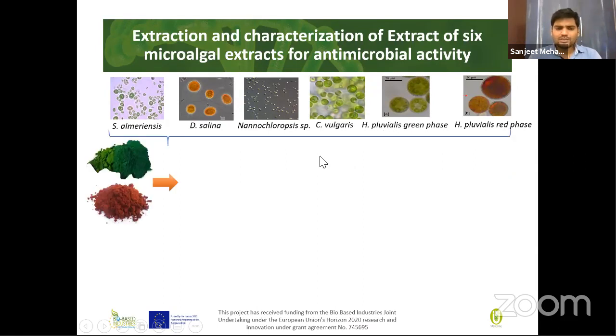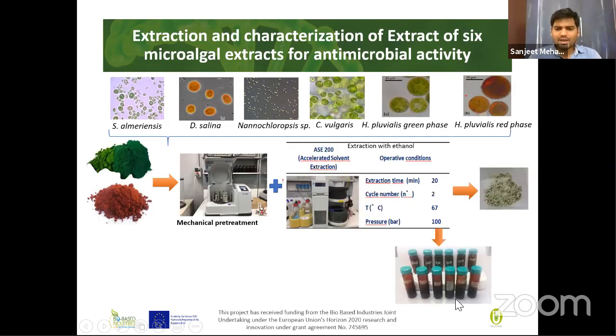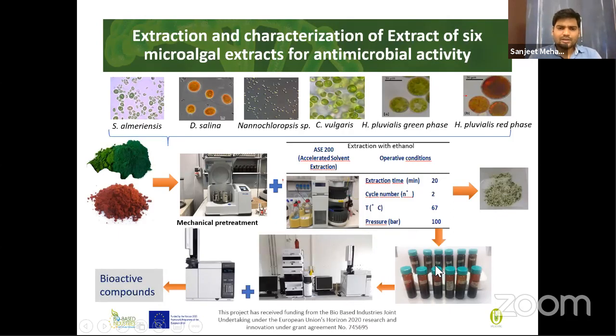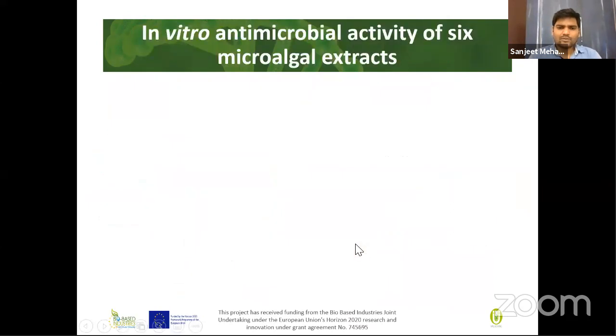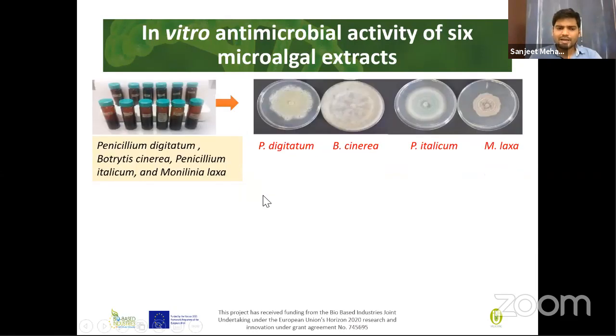Firstly, we extract the compounds, quantify them, and then prepare the extract. Then we check in vitro and in vivo. Firstly, we check the in vitro antimicrobial activity of these extracts of the 6 microalgae, and we test them against fungal and plant bacterial pathogens.